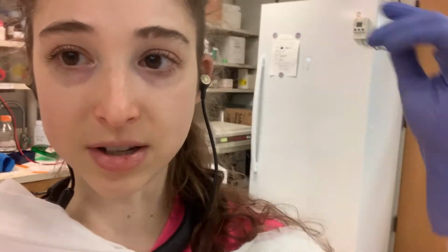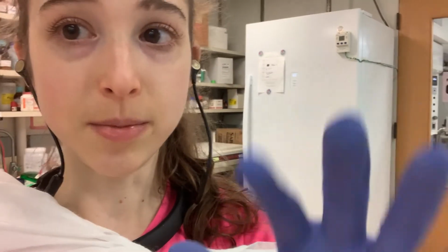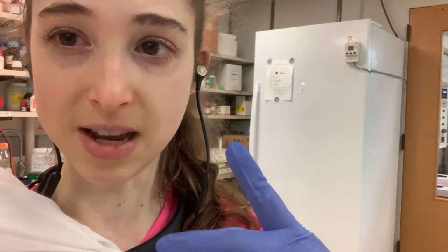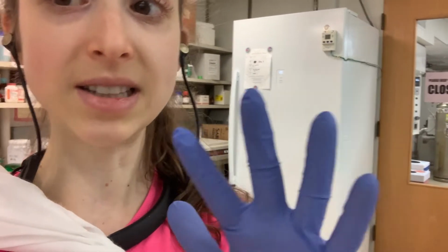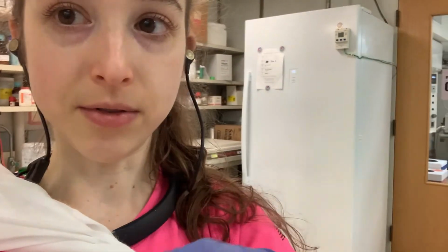So you don't get really impatient, like, I've been adding oodles and oodles and it's not changing, and then all of a sudden you add oodles and you way overshoot it. Then you have to add the base or the acid to go back the other direction. So be aware of that and be patient. Sometimes it takes a while for the pH to stabilize. Typically I'll get it to the pH I want, and then I'll just let it sit there for a while and make sure it's actually stable at that pH, because sometimes it'll waver a little.